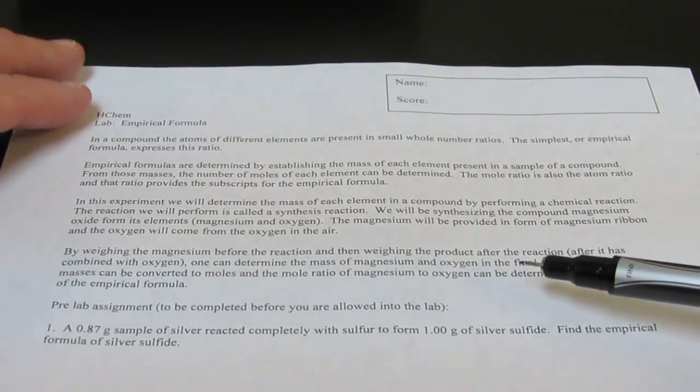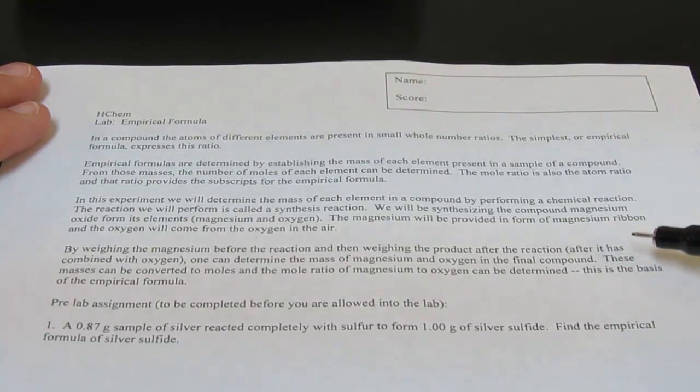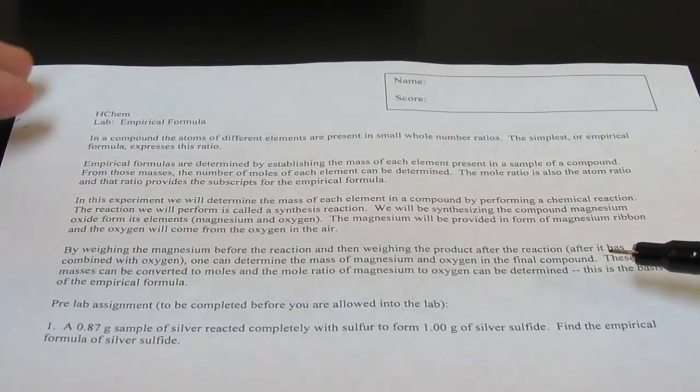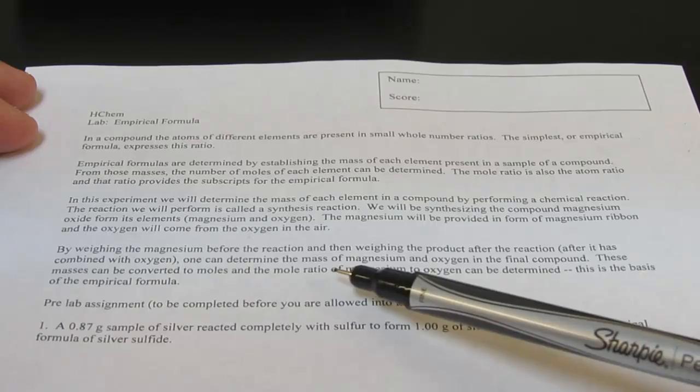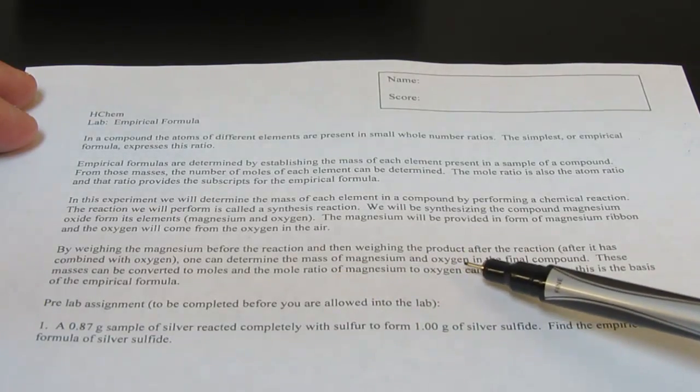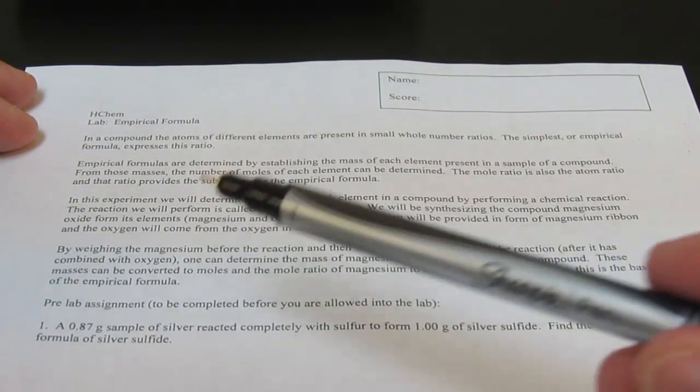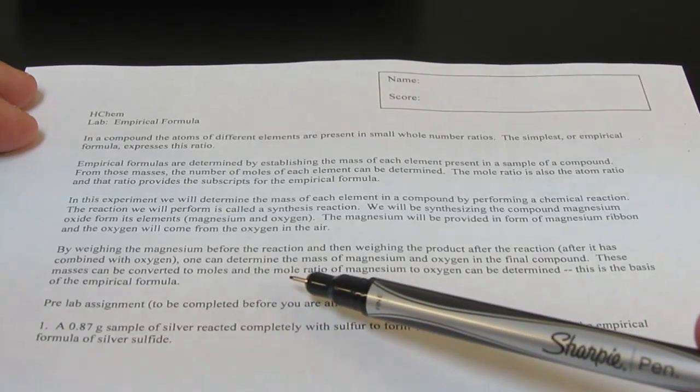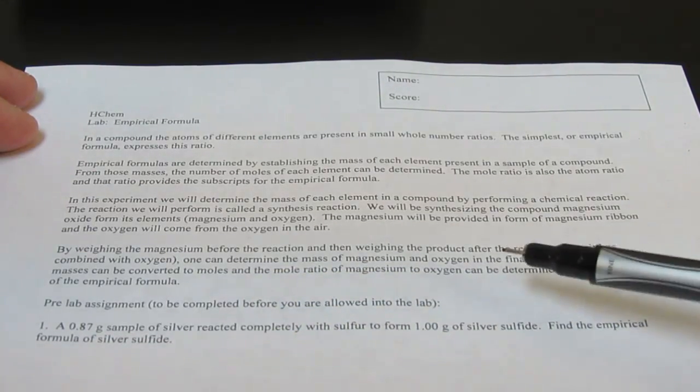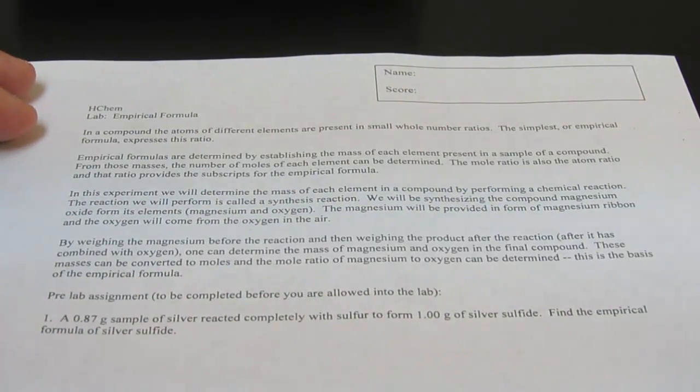By weighing the magnesium before the reaction and then weighing the product after the reaction, that means after it's combined with oxygen, we can then determine the mass of the magnesium and oxygen in the final compound. These masses can be converted to moles, and the mole ratio of magnesium to oxygen can then be determined. This is the basis of the empirical formula.